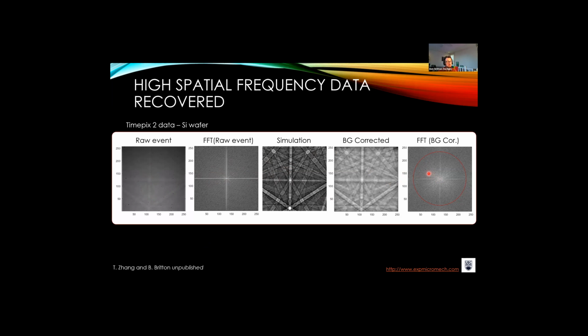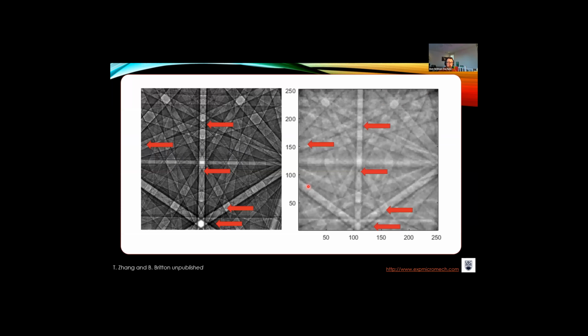So we get probably a factor of 2 plus of what's called the modulation transfer function, or the detector quantum efficiency associated with this detector. And that's super cool because it enables us to see very fine features. Specifically, we can start to see that there's a fine band edge presented here. We can see the cross-section associated with this little dimple. And these crossing points, if anyone has done Kikuchi-based TEM imaging, can be super useful for lattice parameter assessment or energy and other bits and pieces. So that's why I like that.